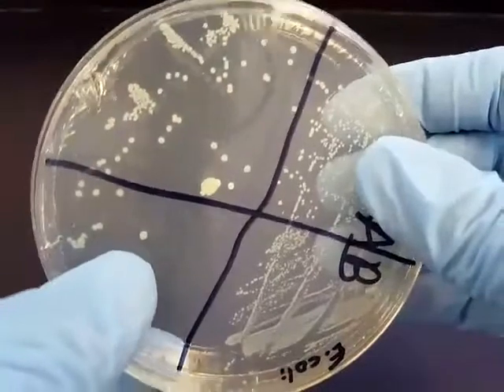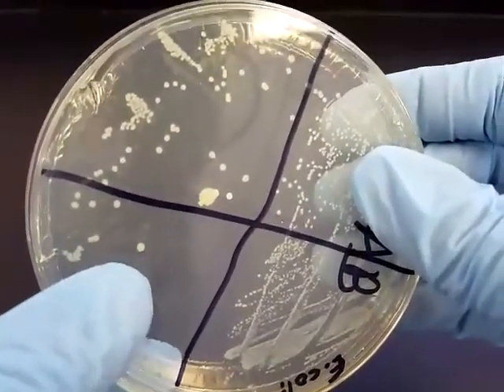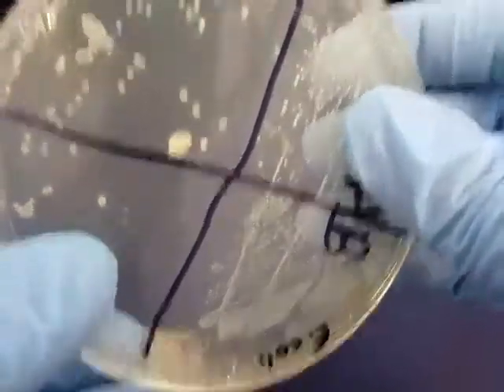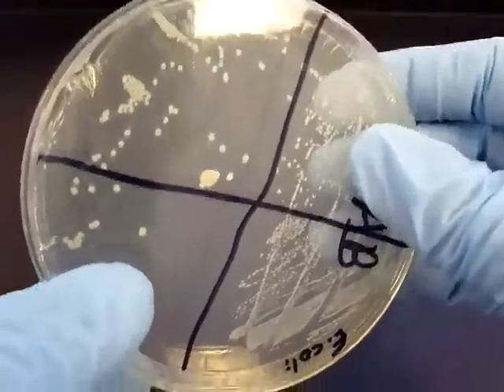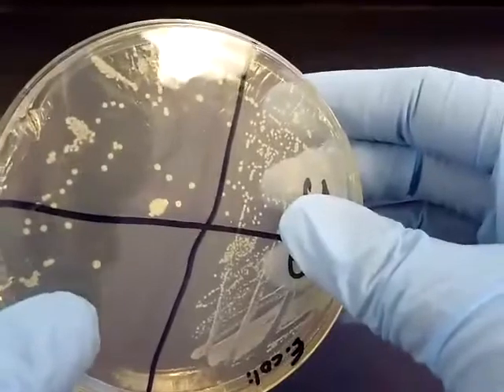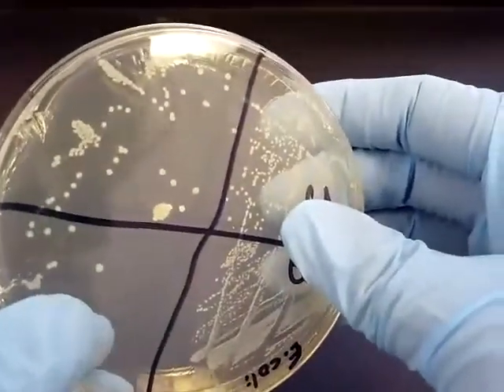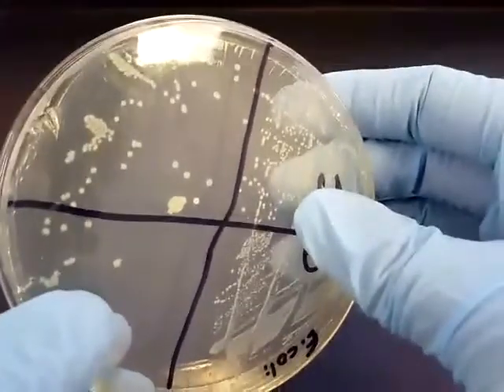The other thing that you can notice about this plate is all of the isolated colonies are the same color, approximately the same size, the same shape. So now we can confirm that this was a pure culture, or this was only one species that is growing on the plate. If you're going to culture from a patient, usually you're going to see lots of different colors, and there's going to be a lot of different species of organisms that are growing from a patient sample.